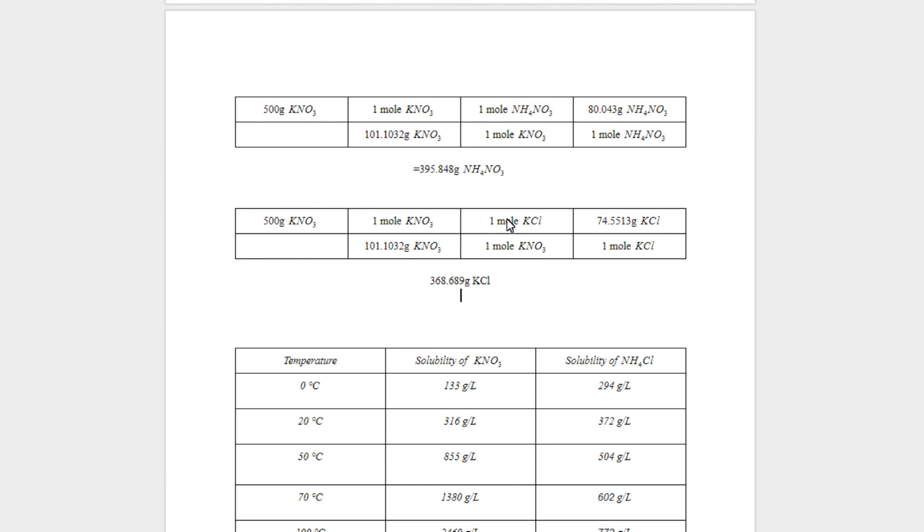Alright, so now that we know Wikipedia hasn't lied to us, and the reaction is favorable at room temperature, we can go about actually making some of the potassium nitrate. And so if I want to produce 500 grams of potassium nitrate, you can see I've done some simple stoichiometry to determine the amount of the reactants that I will need, and I've determined these values. So now we can go weigh out how much we need.